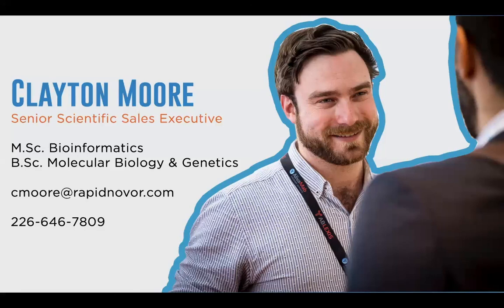Okay, great. And then another one is, can we sequence proteins? Yes, it's always going to be dependent on the size. An antibody is a protein, so we can absolutely handle it. Antibodies have that really nice defined structure where you have the Fc and the variable domain. Our system is optimized towards sequencing antibodies, but we still regularly sequence proteins more generally.